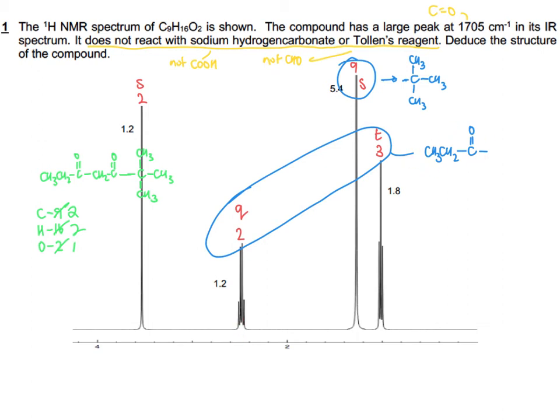That then left us with just needing to sort out the middle bit, the bit between the two ends of the molecule. That could only consist of 2 carbons, 2 hydrogens, 1 oxygen, once we'd taken into account everything that we'd already used. Did a little bit of thinking. Could have got it wrong at that point, but we would have lost just 1 mark in total. And there we have our finished compound.